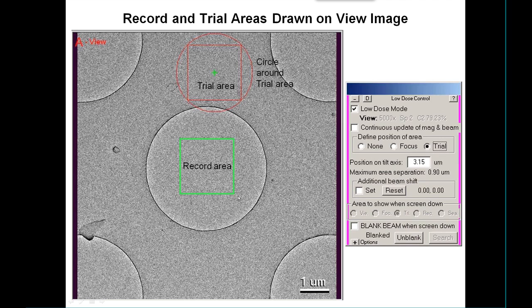To make this more concrete: when we have a view image and go to define the position of one of the displaced areas, you'll see boxes representing the record area and the trial or focus area. There's also a circle drawn around the trial area, representing the fact that if you had the beam adjusted so it was just outside the trial area, it would be that big.